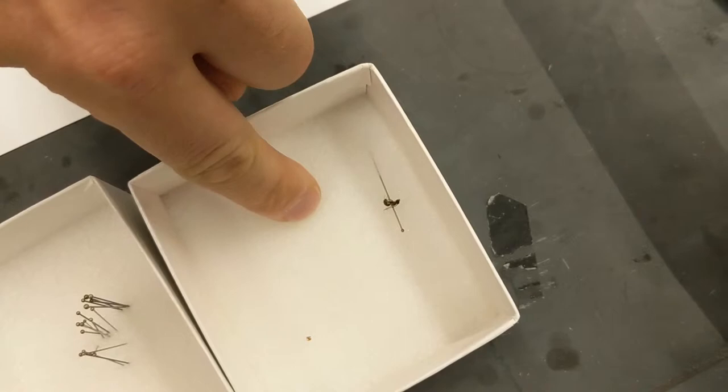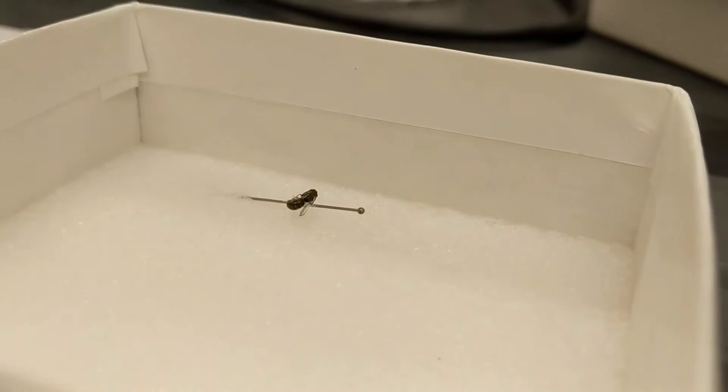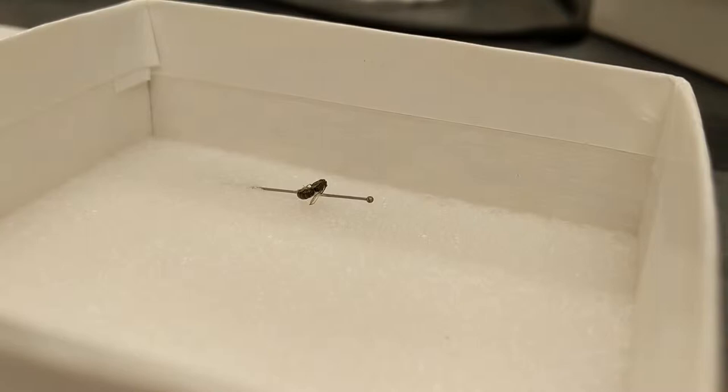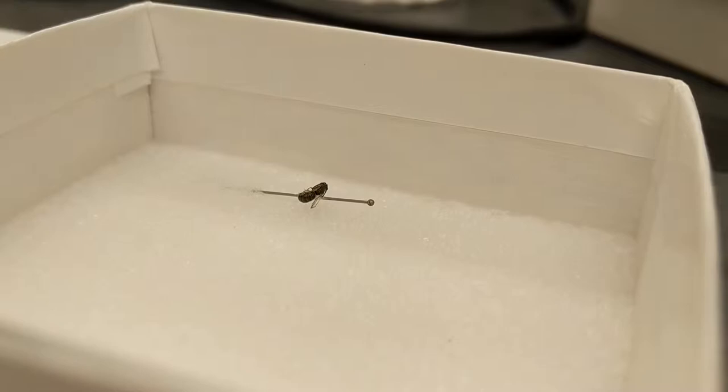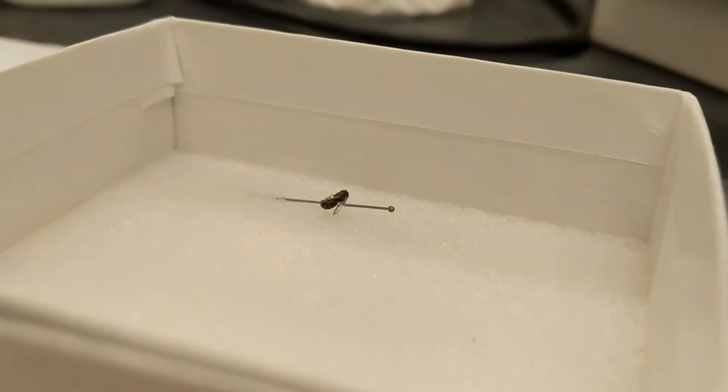This way, if the bee slowly rotates on the pin, it'll immediately have a point of contact with the foam so it won't roll off or move around at all. If it rolls, it'll still be on the pin — one end of the bee is going to touch the foam and it'll stop moving. Then it'll glue in place like that.